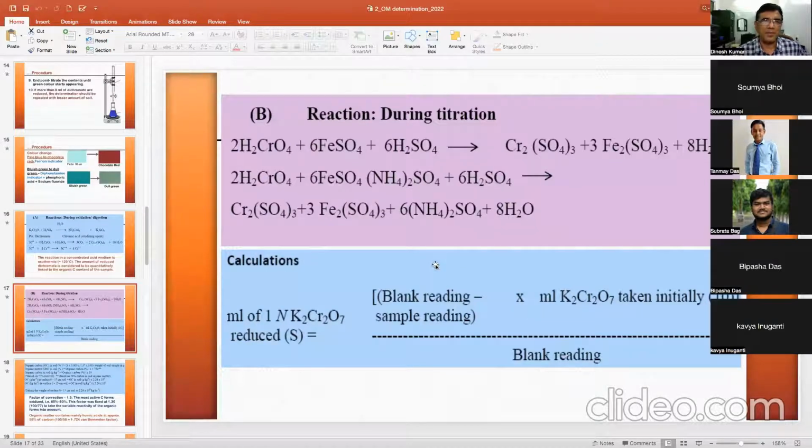Put little bit of this chromic acid into the glassware, it will clean it because it is a very highly oxidizing agent. But care should be given. You should not use chromic acid carelessly. Otherwise you will burn your skin.